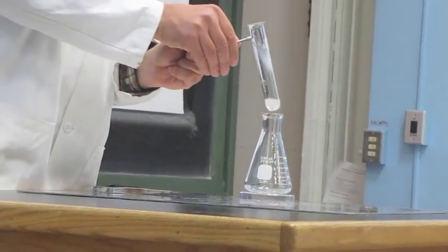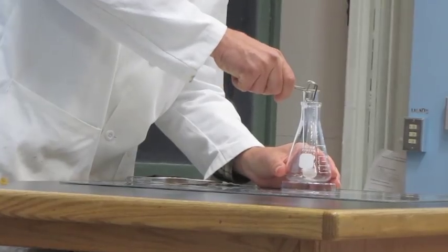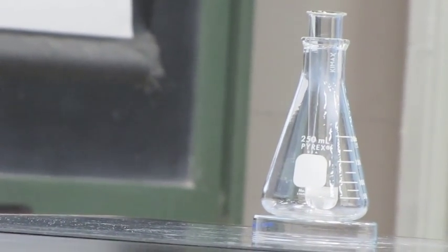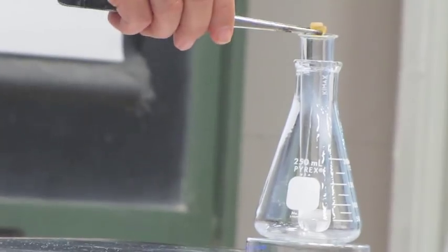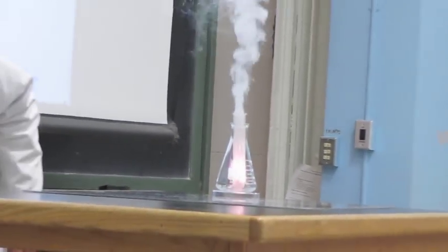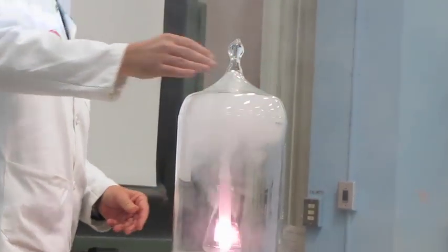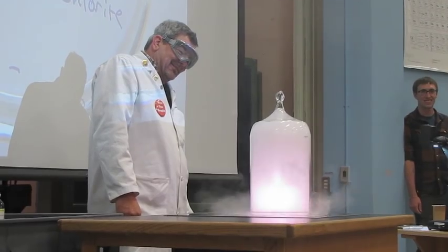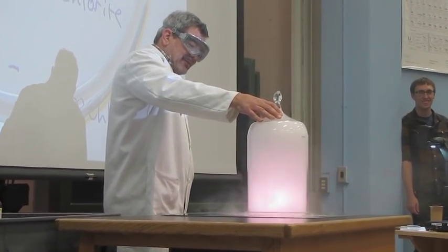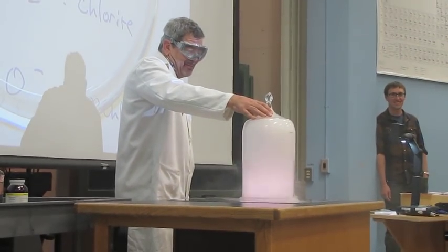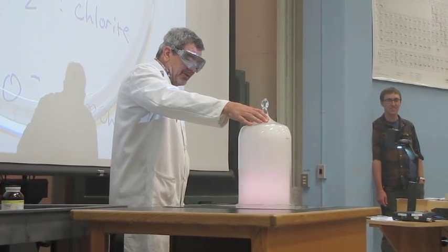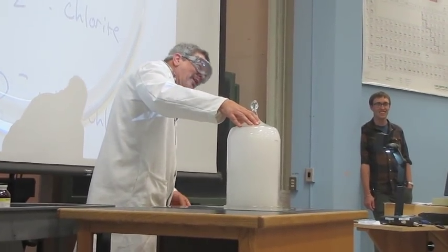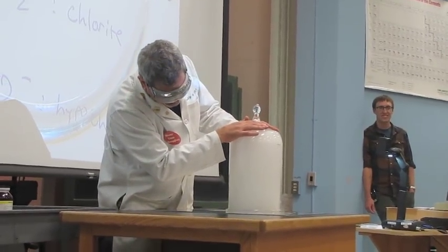Okay, let's put it down here. Grab the other half of Mr. Gummy and see what happens. Whoa! That's a little bit more intense than melting. Did we have a reaction? Yeah, I think so. By the way, that color you see is the color of potassium. So, I think we're going to call that a positive on the gummy test. Yeah. Cool.